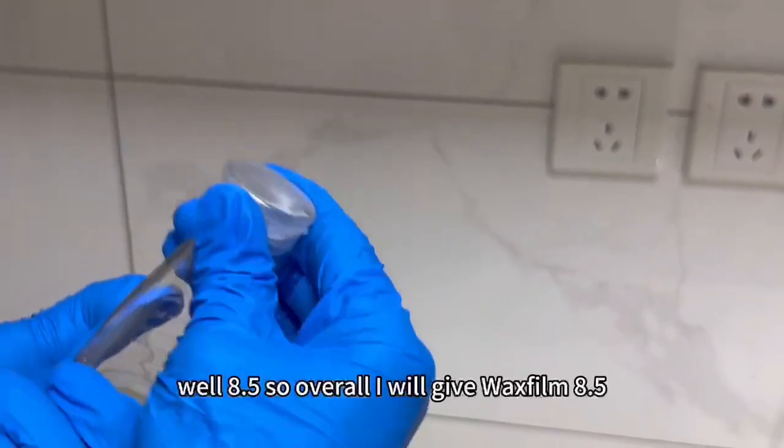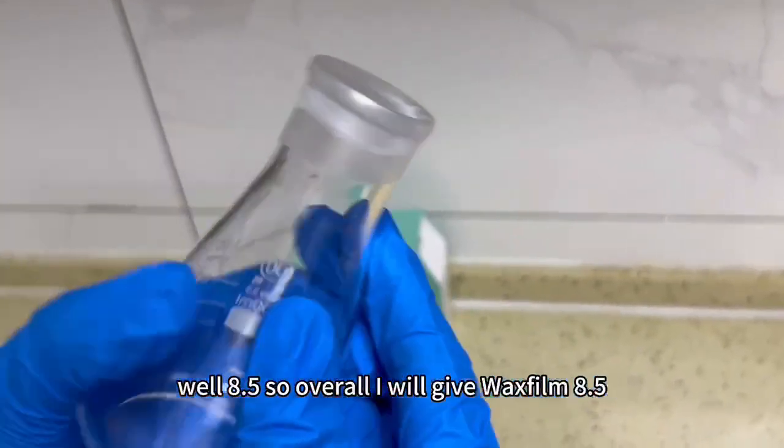Feeling of usage, well, 8.5. So overall, I will give Waxfilm 8.5.